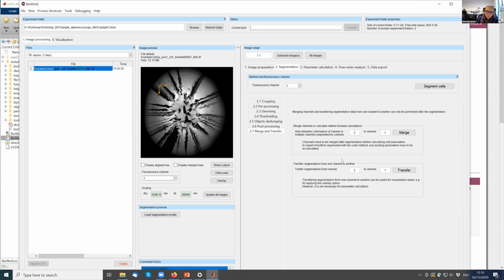So I'm going to merge the channels now. The way that I do this is I choose channel 1 here in order to merge to channel 1. So this channel here, which is written in here, has to be the same as the channel in here.